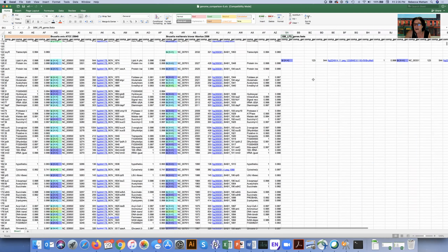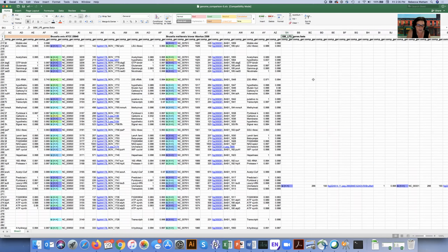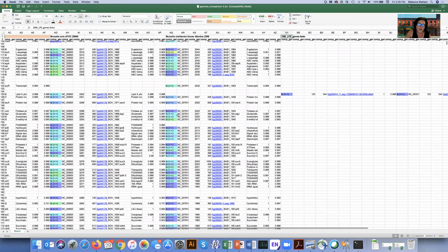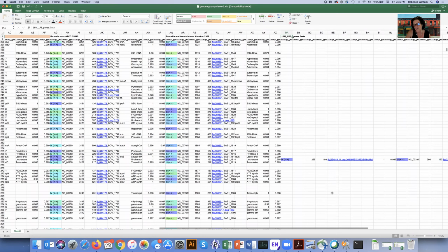So that's very limited. So you can suddenly get a feeling for why you might want to use this as a reference, because if these are the genes you're interested in, that's all you care about. And there's all this other stuff that you don't even want to have to wade through.